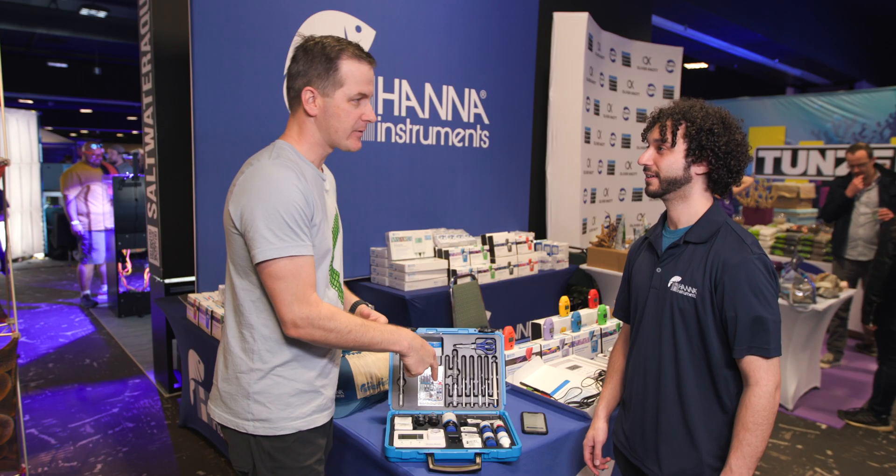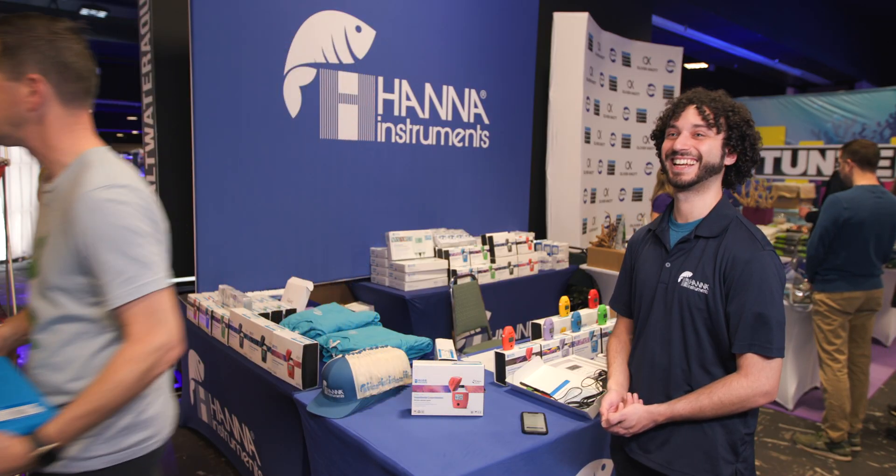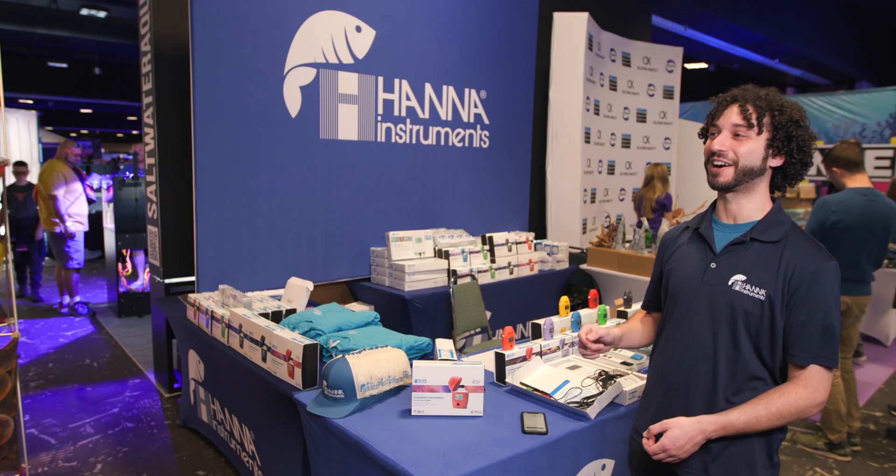This is available now — you can be among the first to get one.